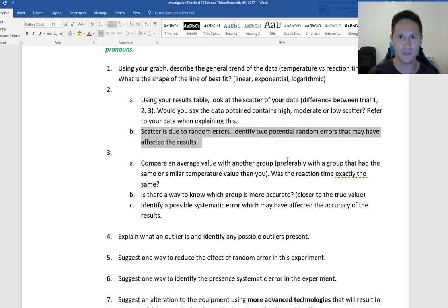So because this reaction involved stopwatches, you can talk about reaction time, okay? Now, what were you looking for in the experiment? You were looking for when you can't see the cross anymore. So that's the end point of the reaction. When you see the end point, you stop the stopwatch. How long does it take? That's your reaction time. And that could be different every time, okay?